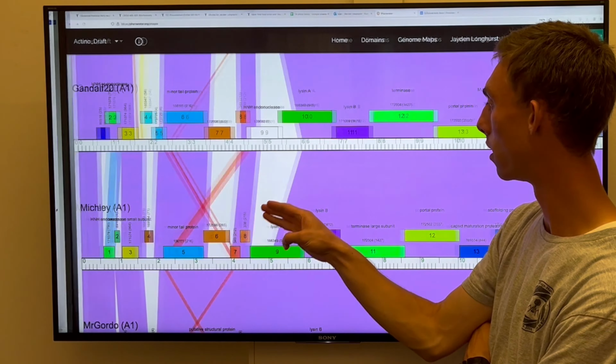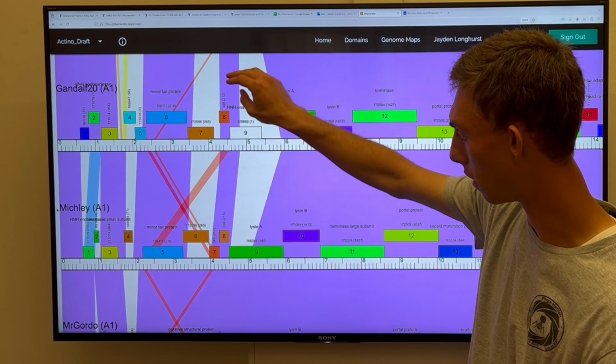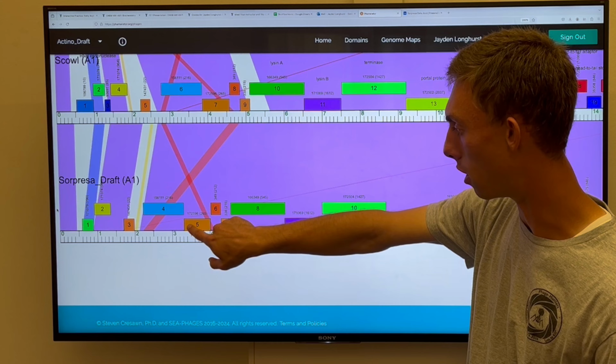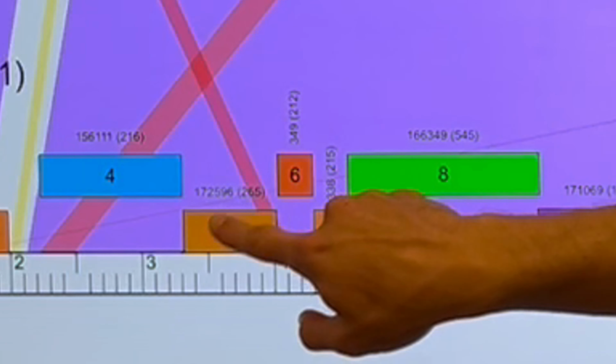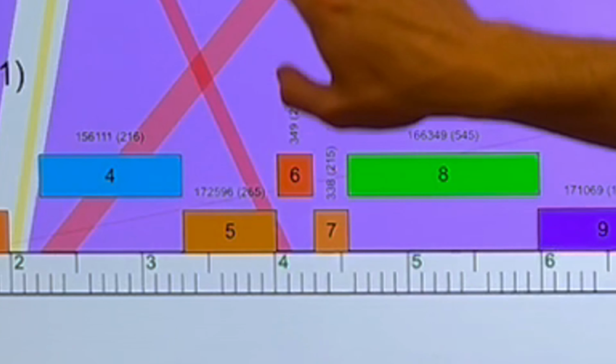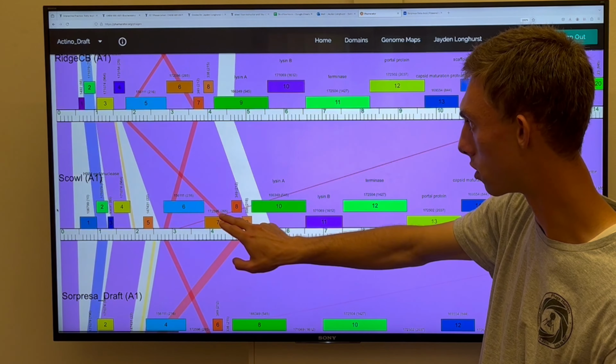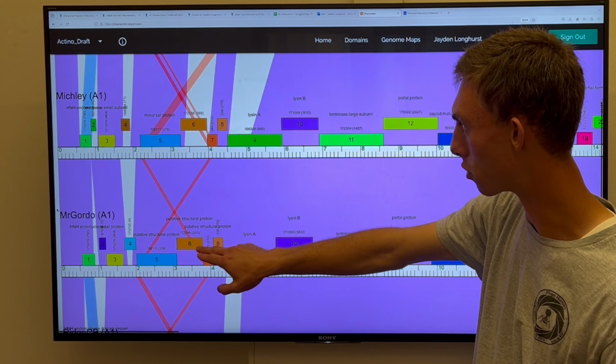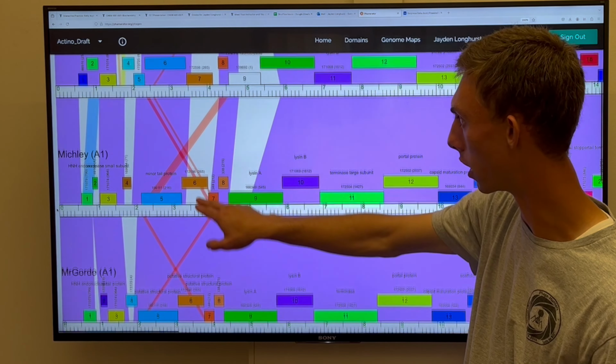If we go back and scroll back down to our phage, here we see that we don't have the call yet. We scroll up to see if any others do. That just says putative structural protein, not a very strong call again.